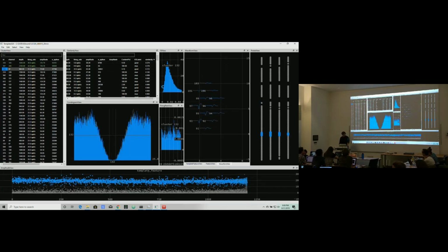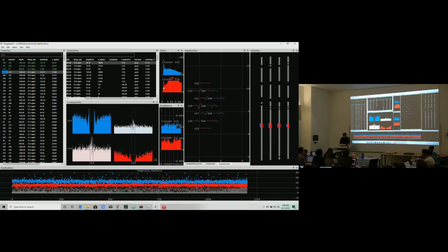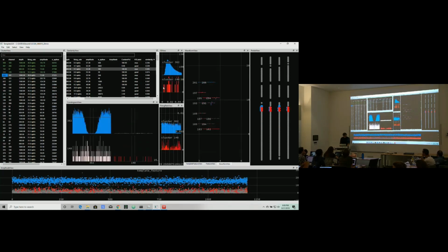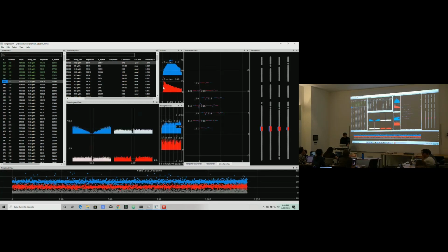Okay. Again, I press space a few times, and if I'm satisfied that there's nothing there to merge with, I just say good. I press space. Nope, nope. It's good. Press space. No, no, good. Okay, so for good recordings, for the best neurons, you'll be doing a lot of these steps. And when things get harder, this process will be more involved, right?